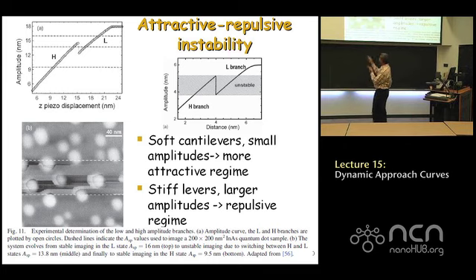That's what happens. So just by looking at the topography image, if you start thinking of what is happening, don't think of it as an image. Think of it as up and down. What is the Z piezo doing up and down to make this happen? And it becomes perfectly clear what's going on, okay?